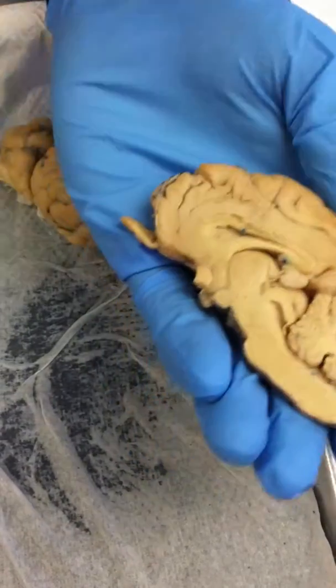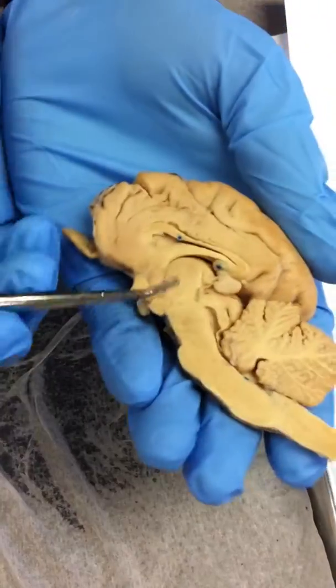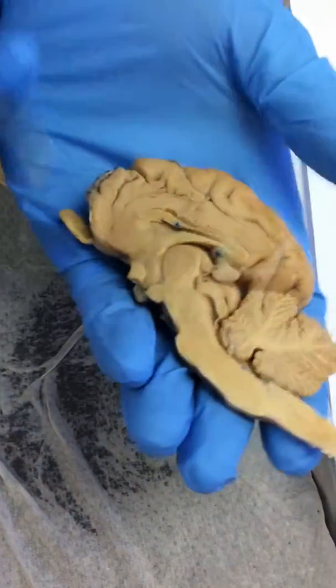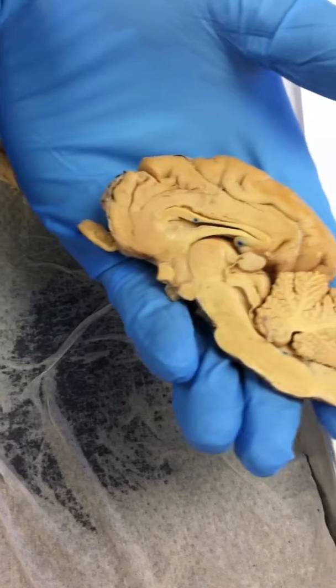Then we have the septum pellucidum. Septum pellucidum is the skin that would go over the lateral ventricle. Now, what that does is it separates the left and the right hemisphere of the lateral ventricle. You know what I mean?